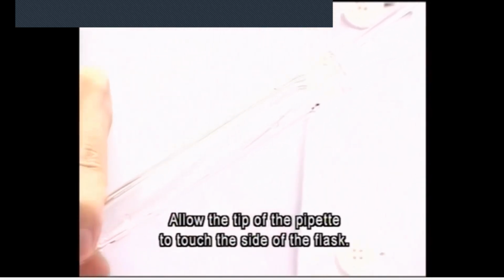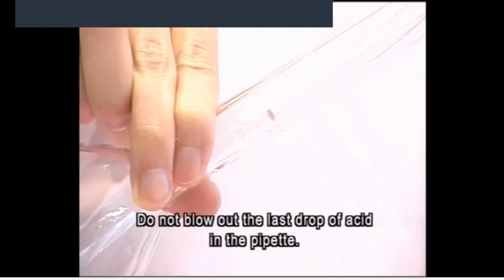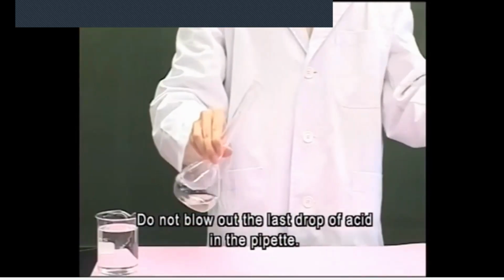Allow the tip of the pipette to touch the side of the flask. Do not blow out the last drop of acid in the pipette.